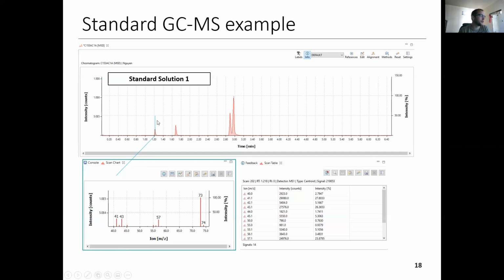So like the counts from each of these different peaks. You can actually select any point along this curve here. Most of them are really low in their total number of counts. And so for our standards, which we prepared, we think there should be 4 different molecules in there. So this looks good from just a first approximation here.